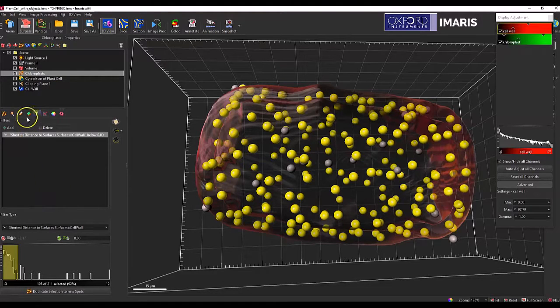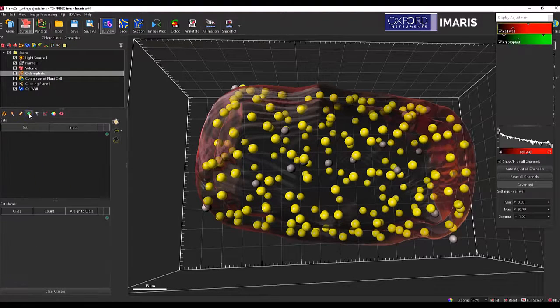or you can use a label to maintain the entire population of your original analysis, like your original spots object in this example. The ones that you're not interested in are still in the statistics that are generated, but the selected ones will have a label attached. I can create a new set by clicking the green button and entitling it something like interior.